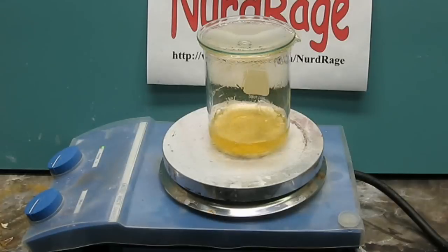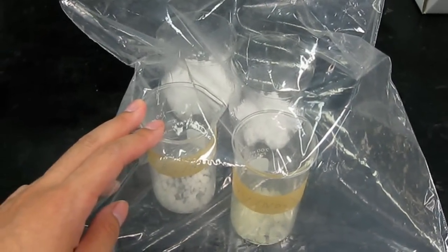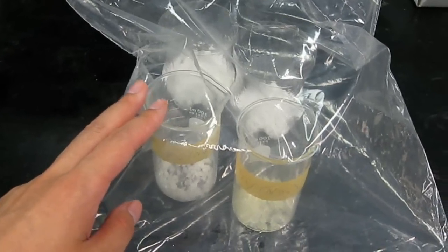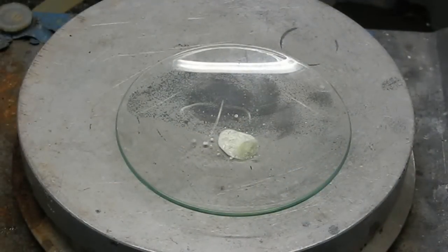At this point take it off heating and once again let it dry. You may need to use the desiccator bag we showed you in a previous video. I found the desiccator bag was a must-have in the summer when the ambient humidity was very high. You cannot simply boil down the mixture because aluminum nitrate decomposes if heated when dry.